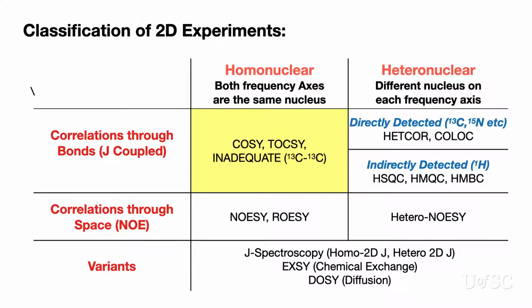However, there are many more. The TOCSY experiment gives results similar to the COSY, but it extends the correlations over all protons in a spin system, not just close neighbors. Since carbon-13 natural abundance is so low, special experiments have been developed to detect interactions between directly bonded carbons. The INADEQUATE pulse sequence is the most common, but these experiments still suffer from low sensitivity and usually require very concentrated samples and are not commonly run.